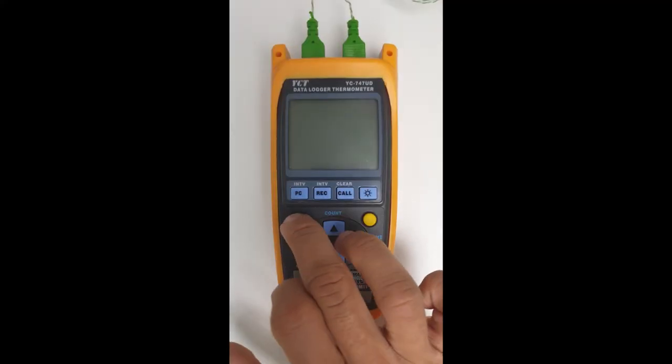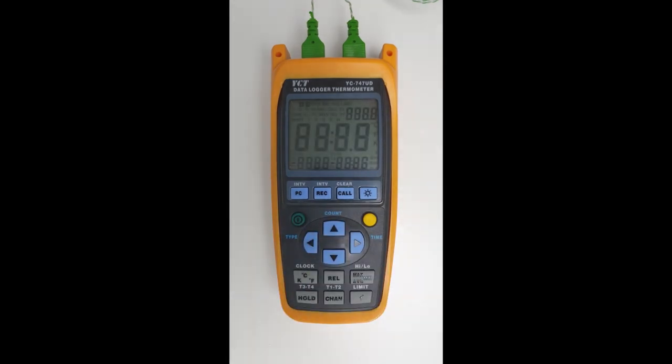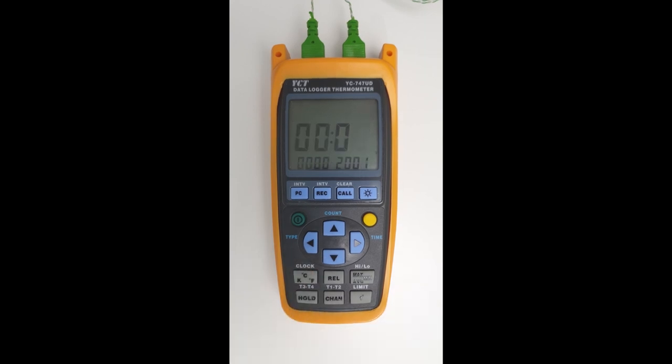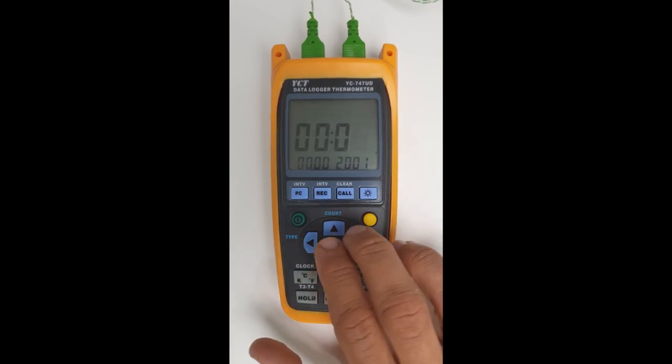Let's switch the unit on. The first thing we'll do is set the date and time. We can do this by clicking on the yellow shift button. As you can see, shift appears at the top, and then click on the button where it says clock above it. And now we can set the date and time.